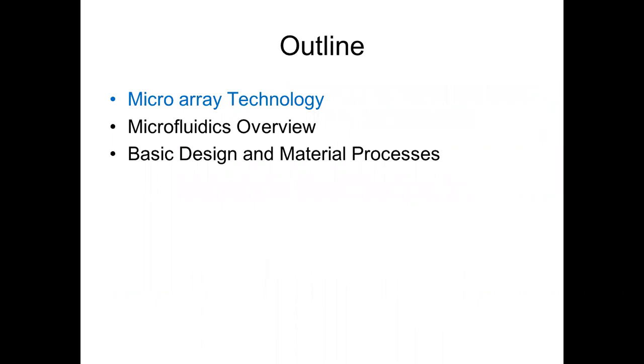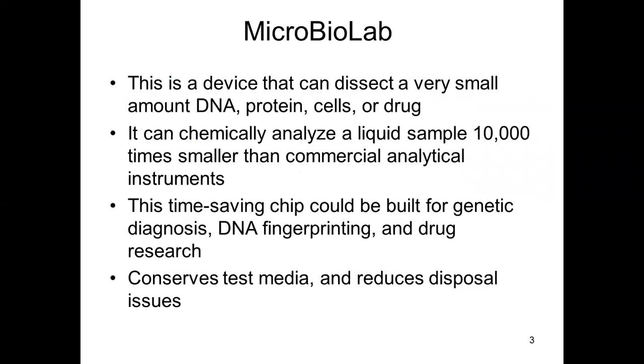And then what we're going to have to do is develop some concepts of how we would use microfluidics. So microfluidics is the science of small amounts of fluids on the nanoscale or microscale, and we'll see where we would use that. And then we'll take a look at some hardware basically and some materials that we would use quite often to accomplish the task of building microfluidic devices.